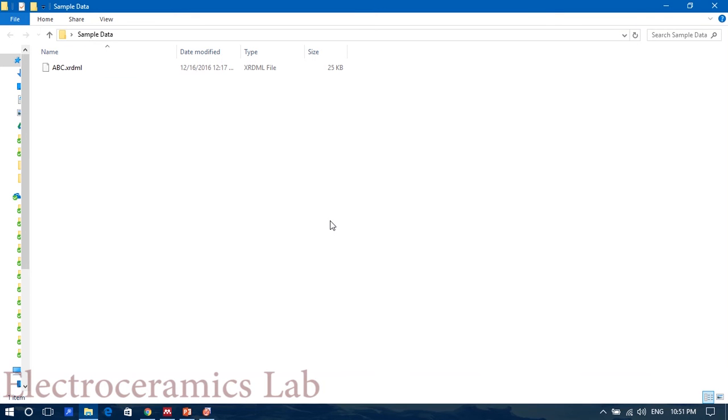In this video we'll tell you about how to determine the background of an XRD pattern and how to make the background of an XRD pattern straight, level, totally horizontal.